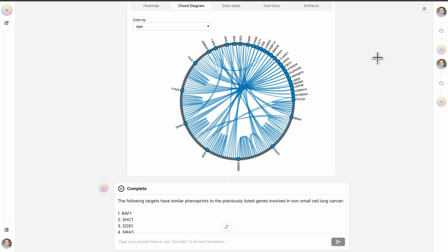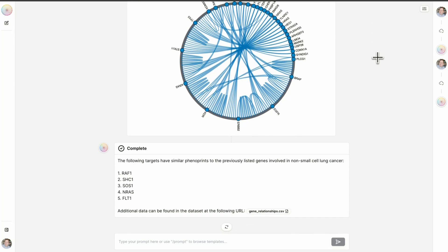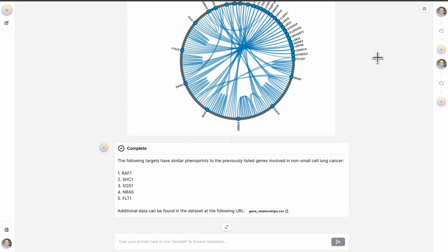If we were close partners, however, we could conduct the following steps for much more novel gene associations, as we have with our colleagues at Bayer and Roche-Genentech. Now that we've chosen a protein target, we're ready to create a new chemical starting point to kick off the program. We could do this in a more unbiased phenotypic way by using Lowe to query nine-point dose-response evaluations we conducted for more than one million compounds using Phenomics. But instead, let's show off some of our digital chemistry tools that allow us to take a more target-centric approach. So let's use Matchmaker, a machine learning model specifically trained to predict drug-target interactions.